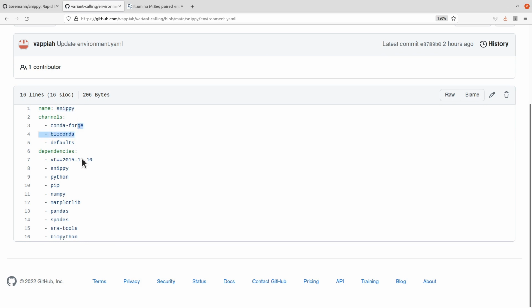We have some channels, and then the list of packages we want to install. To download, let's first click on the raw button. Just come to the right side here and click on the raw button, and then you have this being shown for you.